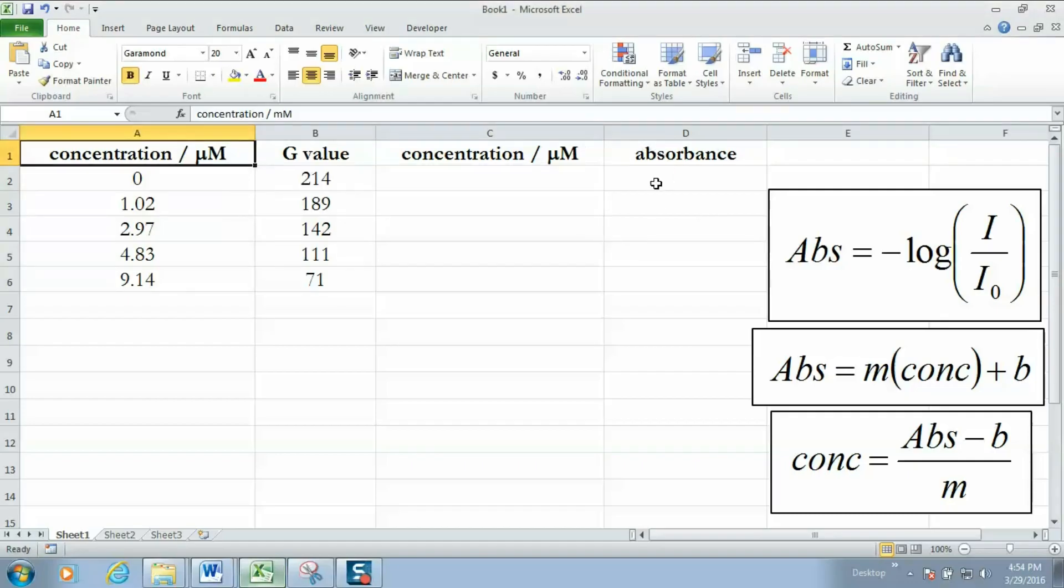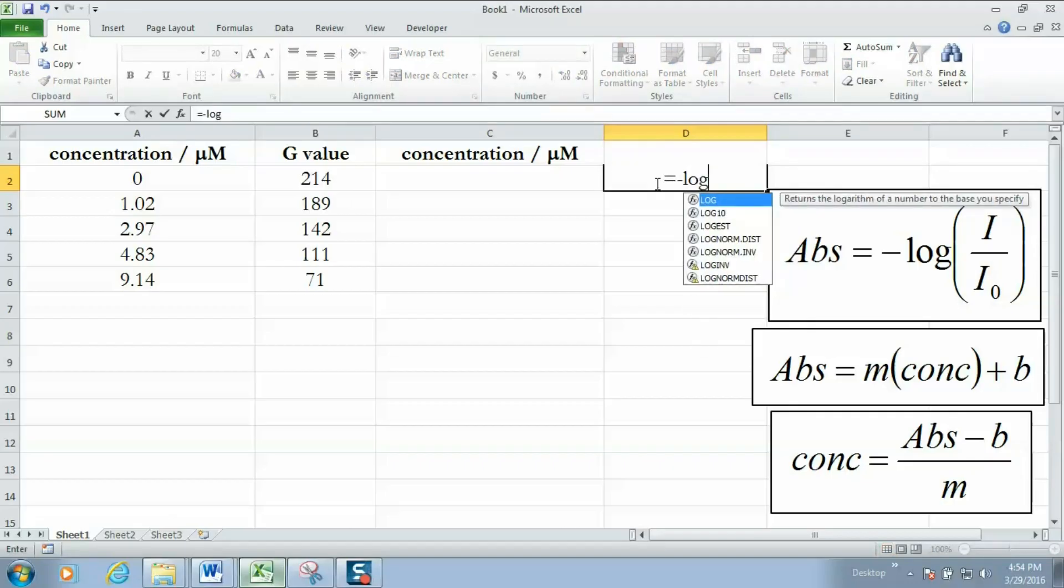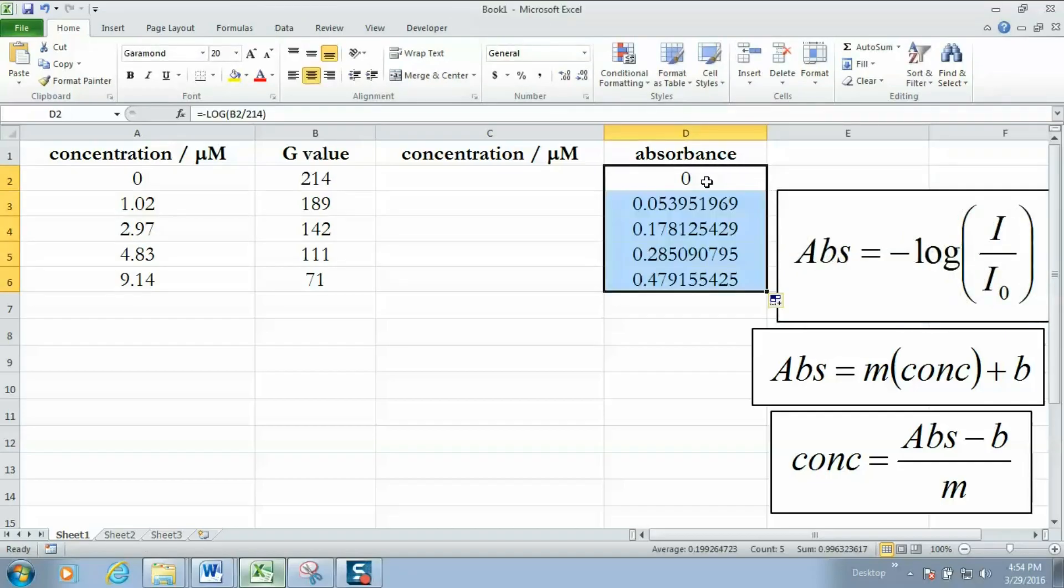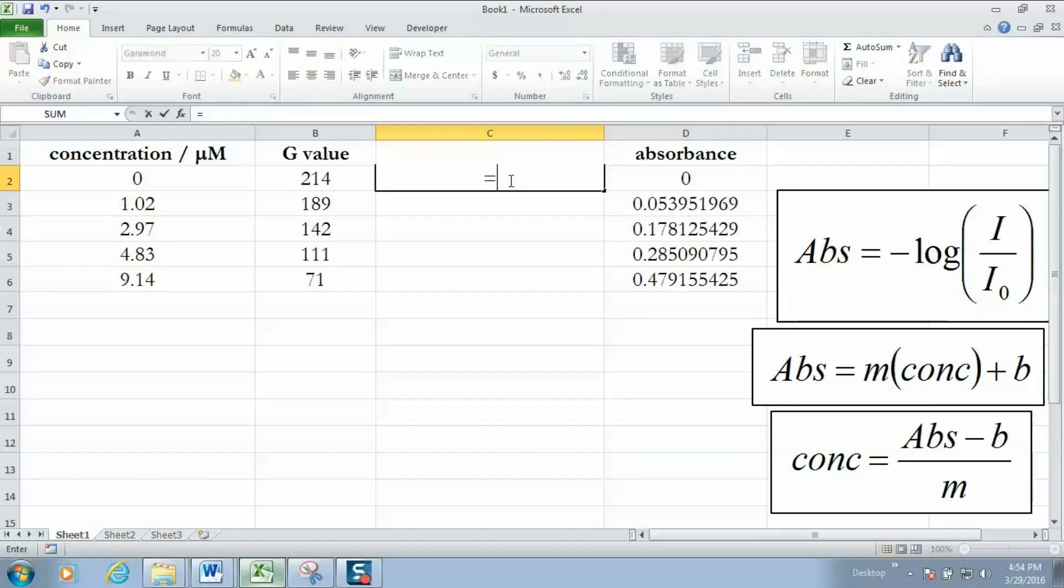I'm going to highlight this cell and I'm going to type equals minus log parenthesis. I'm going to click cell B2 to indicate I want that particular G value divided by the intensity of the blank or the green value of the blank which is of course 214. And I'm going to go ahead and do the same in all these columns. The quickest way to do it is just to fill down. So in this column here we've taken the negative logarithm of 189 over 214. In this column I've taken the negative logarithm of 142 over 214 and so forth. I'm just going to put the corresponding concentrations immediately to the left, that just makes it easier to graph.